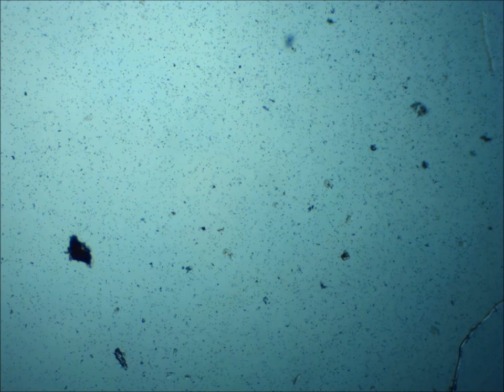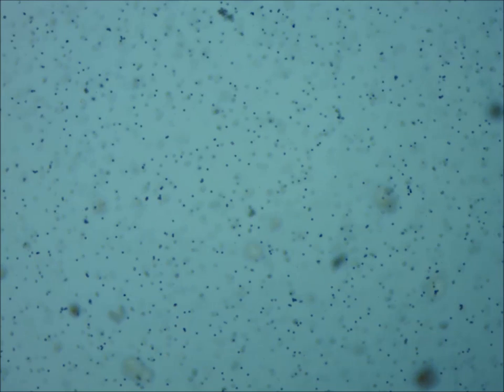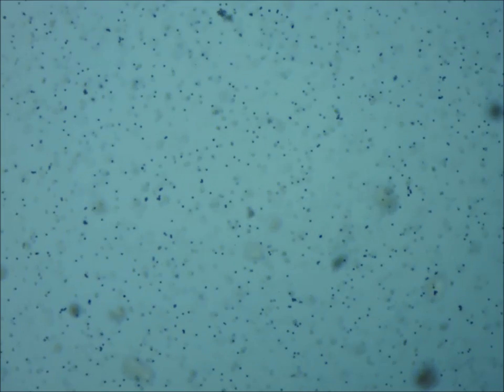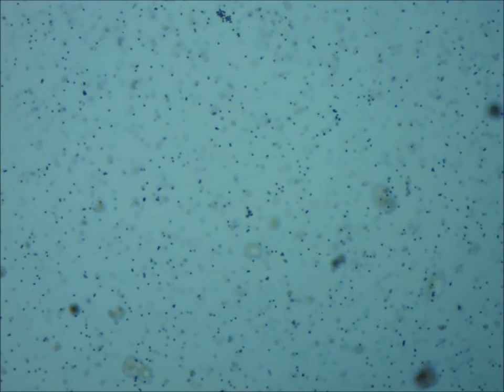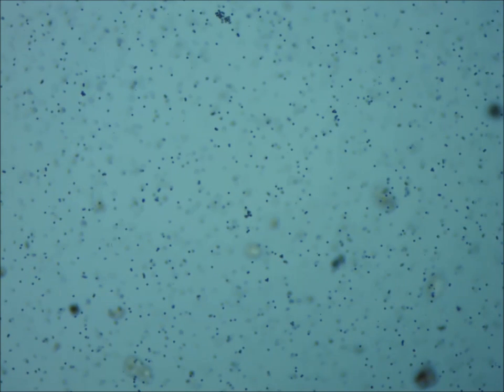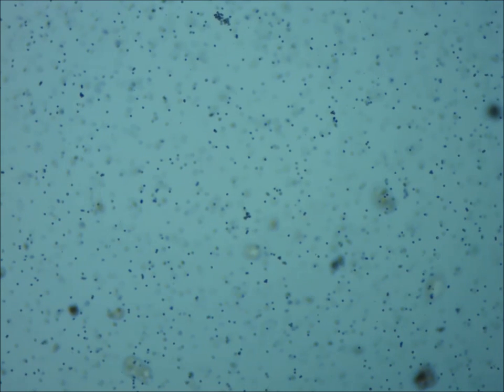Right now we can't really see anything because we're using very low magnification. If we increase the magnification by selecting a different objective and readjusting our focus, there are our beads. They're still very small, but we can see how we can change the focus and look at different depth levels inside that drop of fluid. Let's increase the magnification a bit more to actually see some Brownian motion.